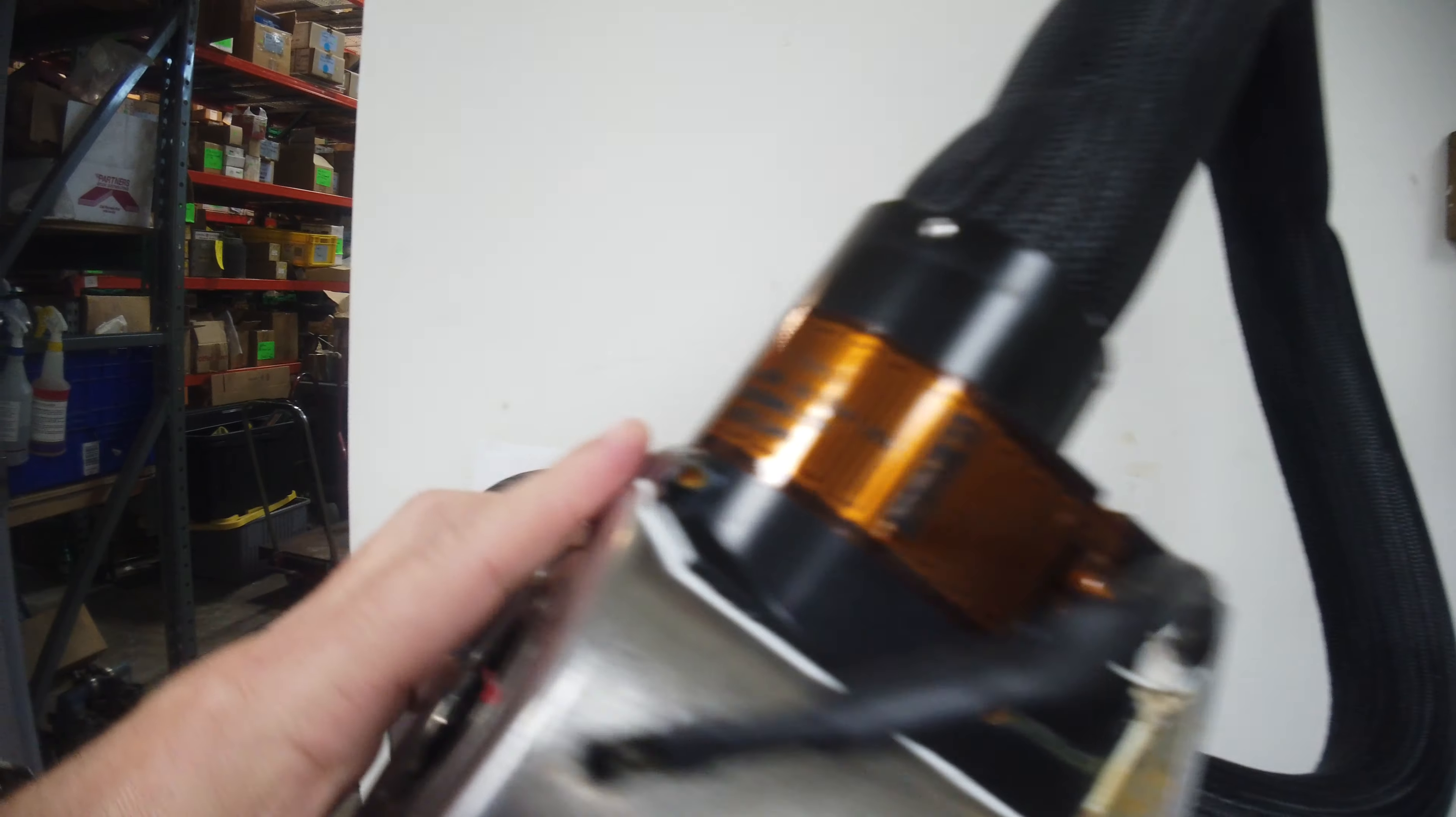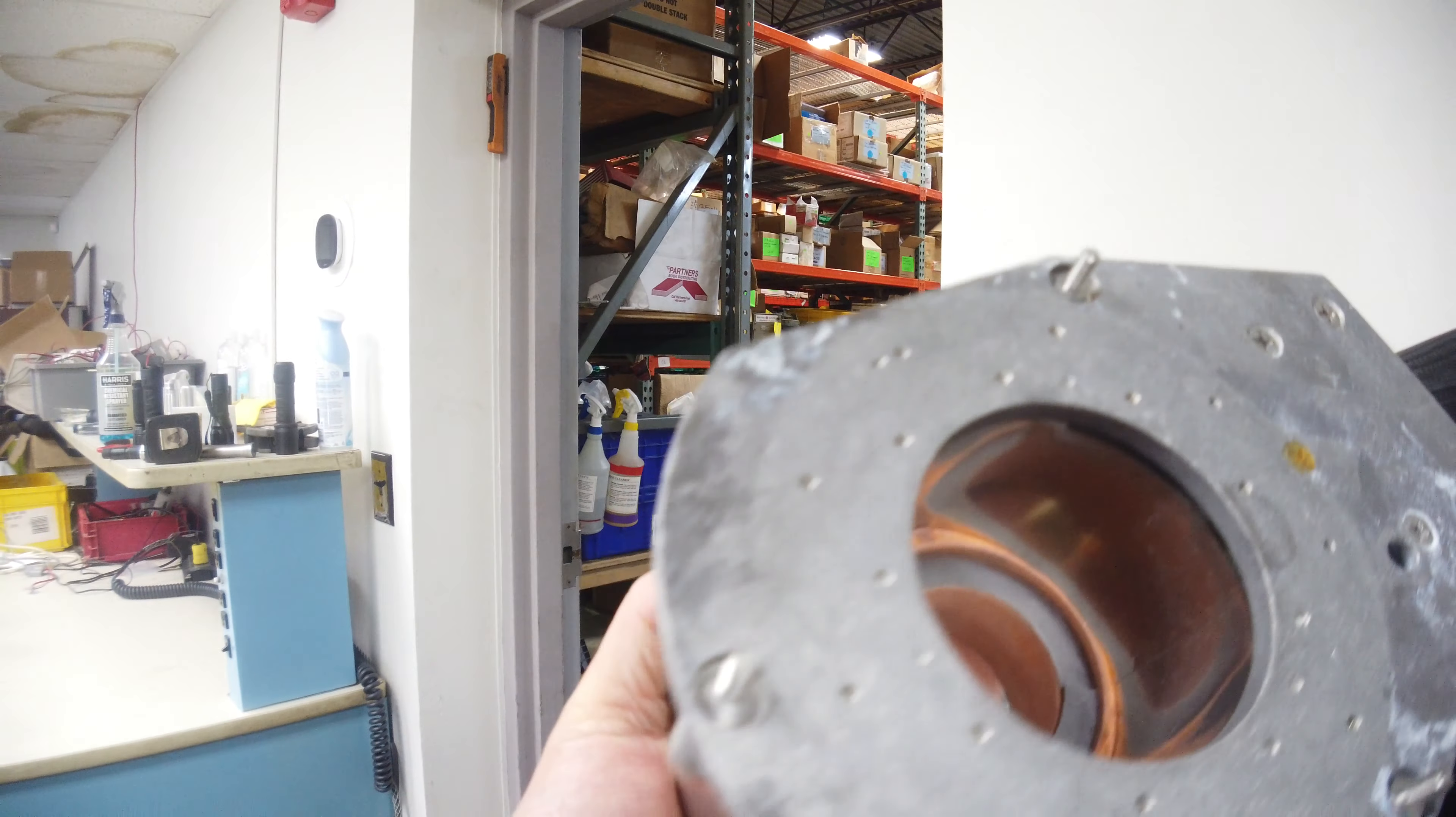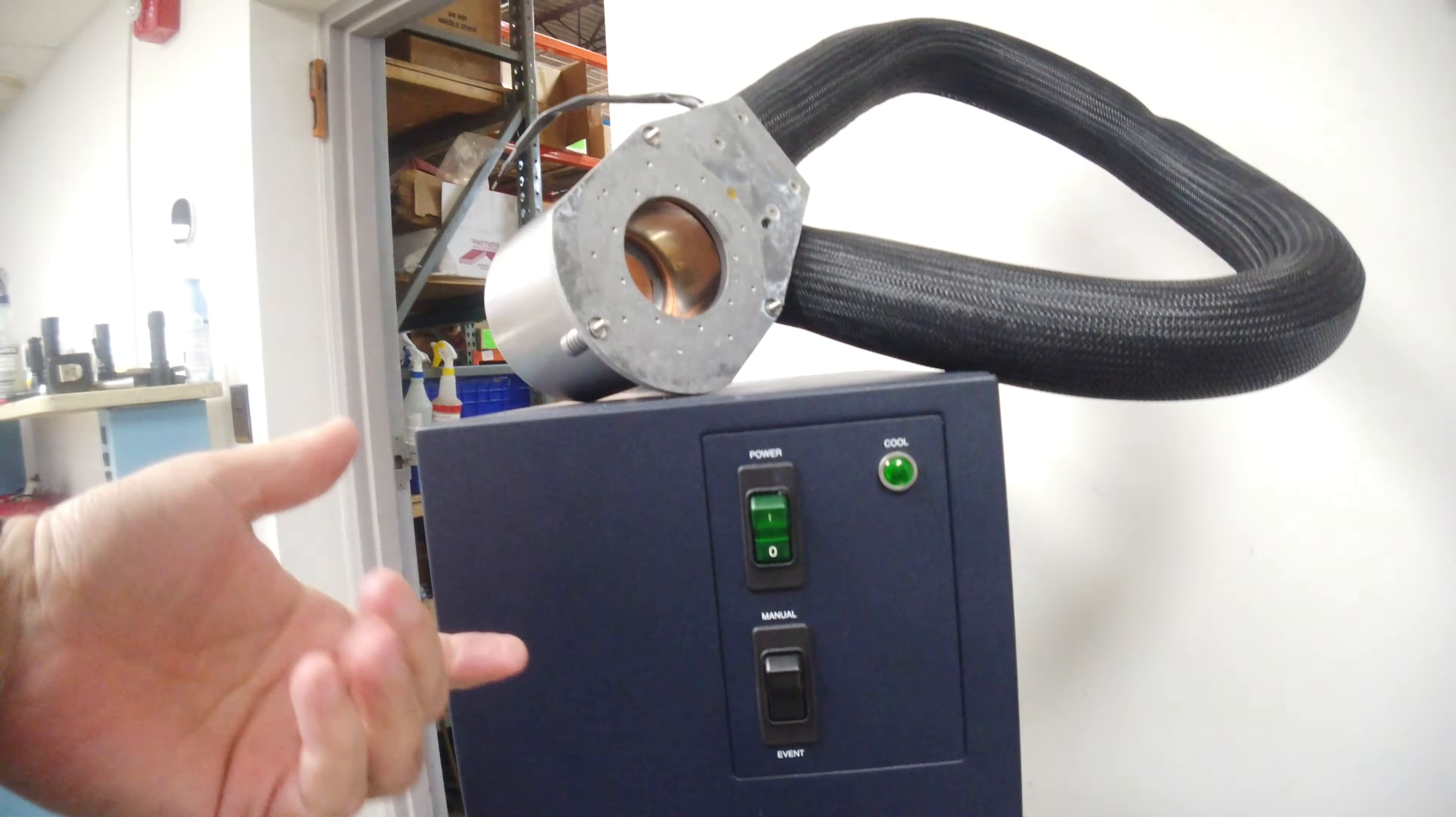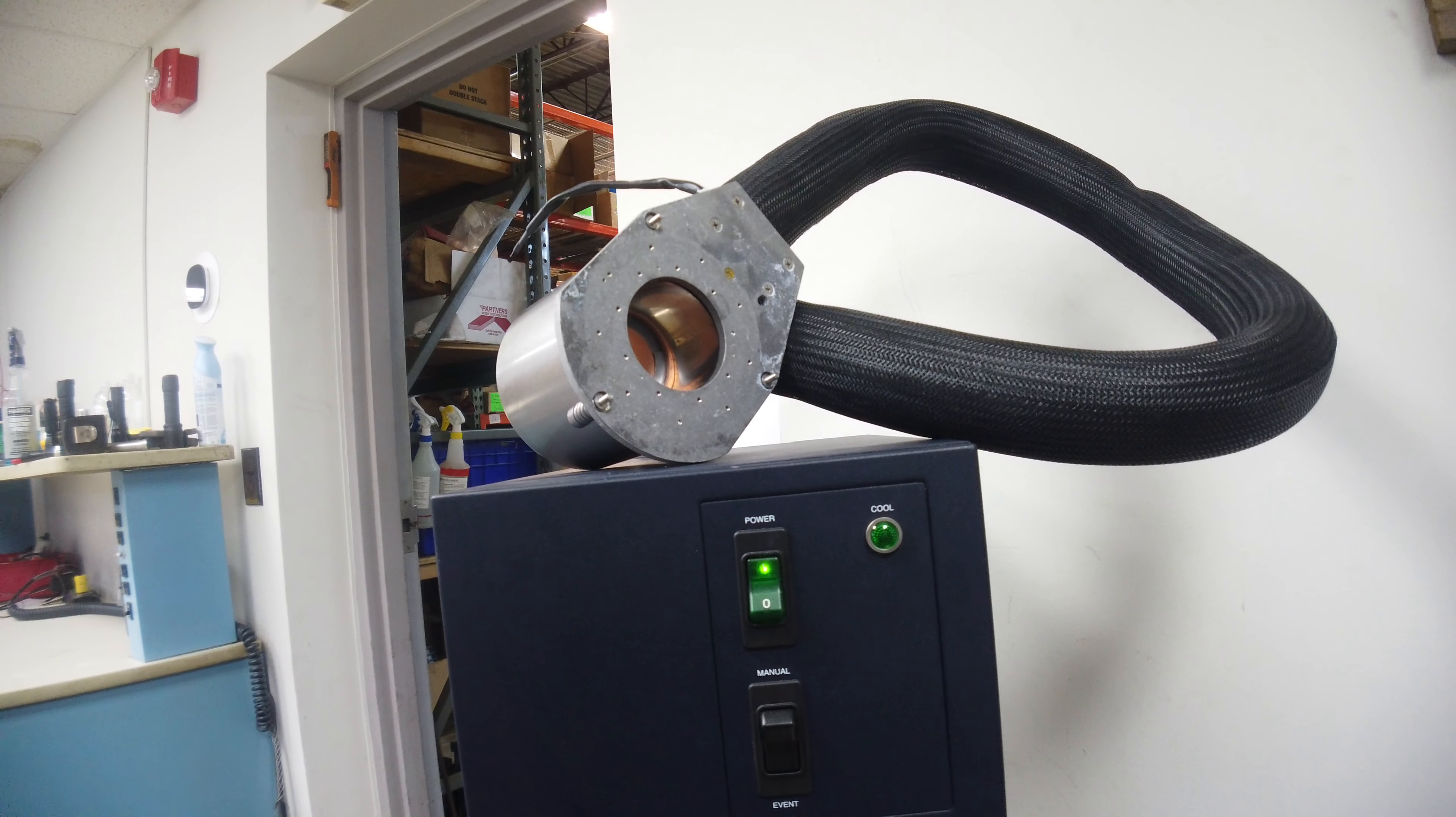And then it's got, you can see in here where the copper fitting and the gasket and everything around in there. It's a 110 unit and I'm going to let you hear it. So click it on.